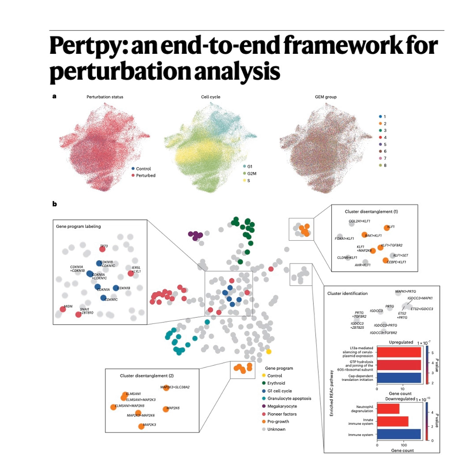Okay, once we've mapped our perturbations, we have to dig into the classic analysis. Differential gene expression, finding which genes actually change. DGE is fundamental, but standard tools can really fall short when your experiment gets complicated. Multiple conditions, multiple batches, nested comparisons. You want to compare drug A in one cell line versus drug B in another, while controlling for the sequencing run. Right, and that gets messy. Pertpy gives you a unified interface to handle that complexity.